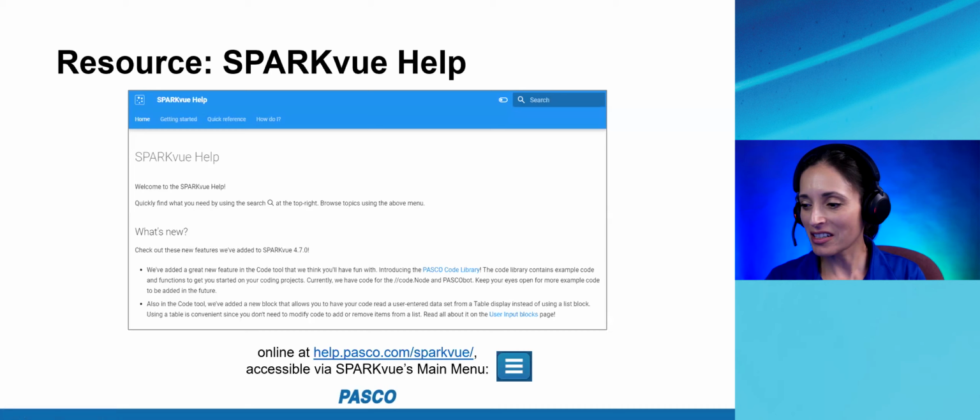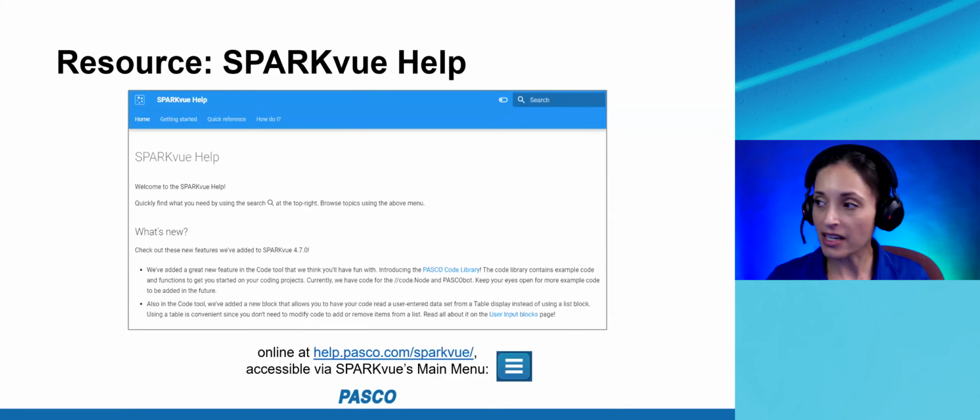How do you get help if you're ever stuck in SPARKvue? Well, there's the SPARKvue help. This SPARKvue help link is actually embedded in the program. I'm going to put it in the chat, but you can go to that link directly in a browser.